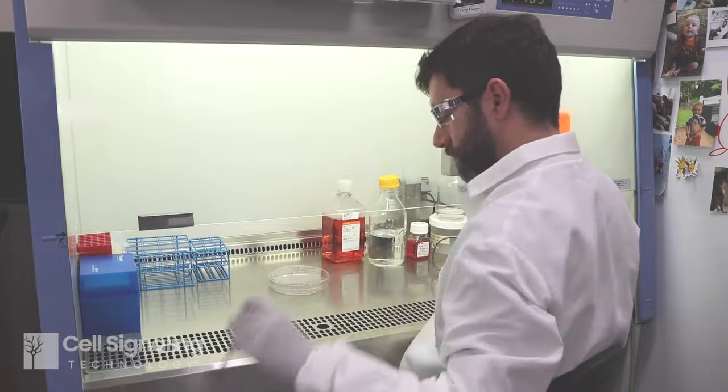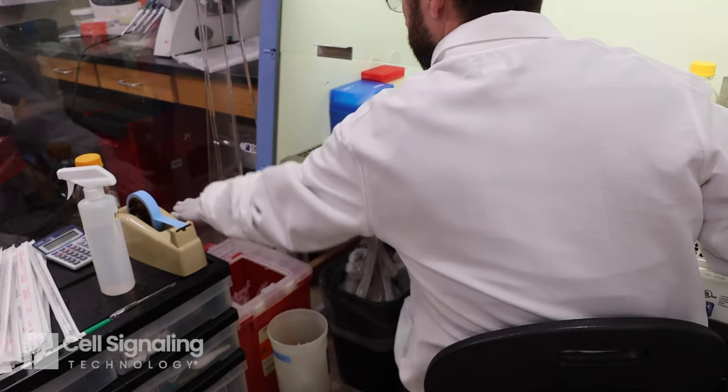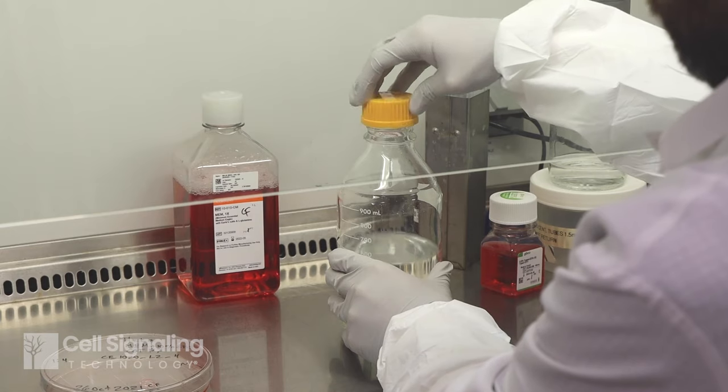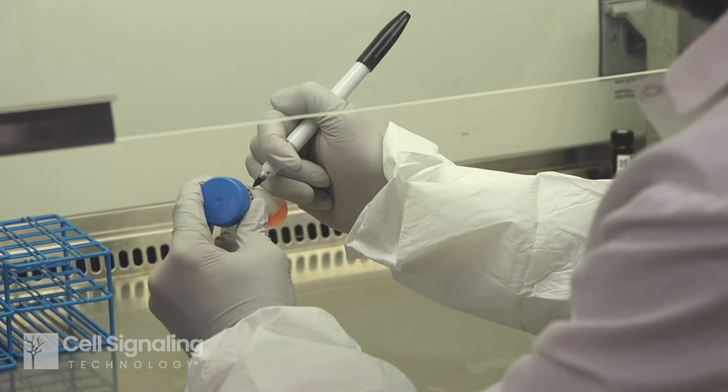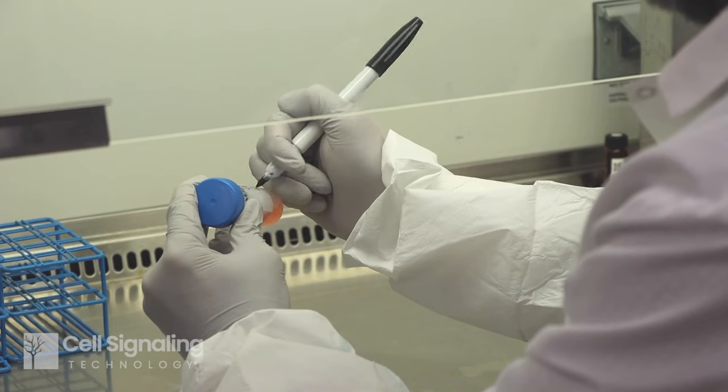Don't reuse tips. Replace caps onto flasks, bottles, or tubes as quickly as possible and take care they are threaded and closed properly. Label your cell culture vessels and any bottles or tubes as needed before removing them from the hood.